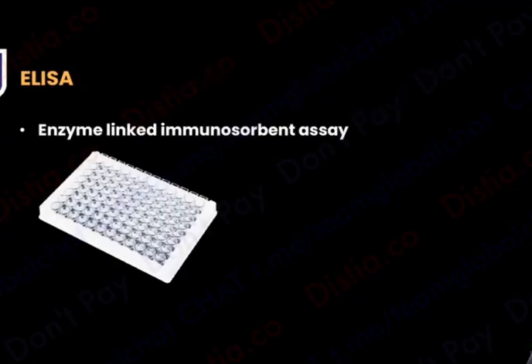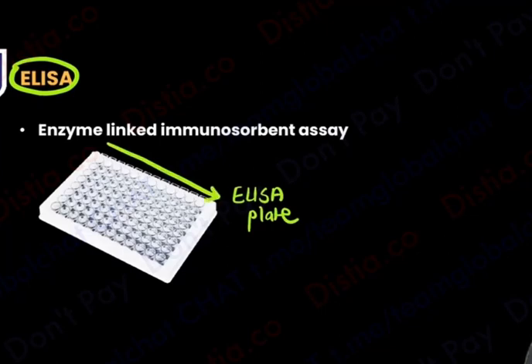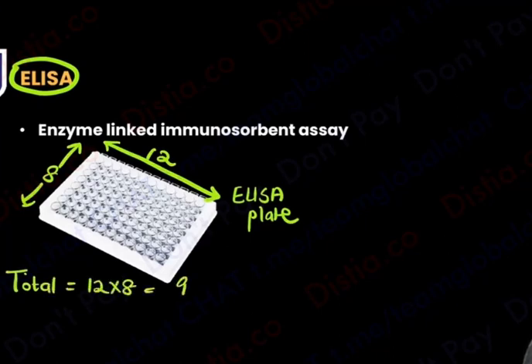Now what we start with next is going to be ELISA. First you need to know that this is an ELISA plate, what you have in front of you. This is an ELISA plate under which you can see there are 12 wells in this direction and 8 wells in this direction. So the total becomes 12 into 8, and that is going to be 96 wells.